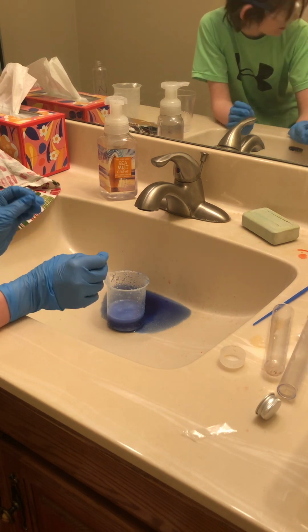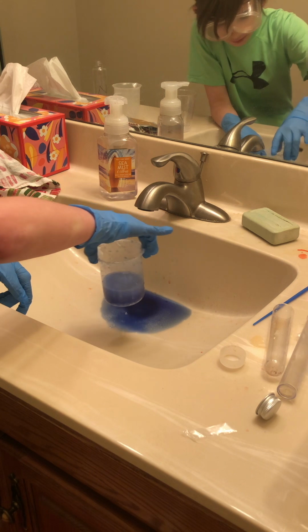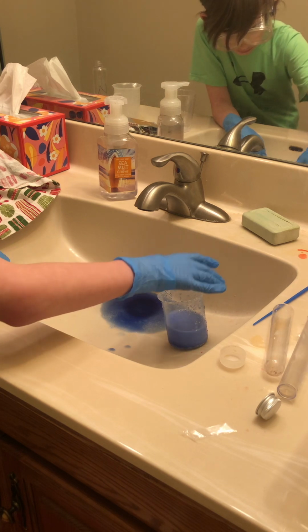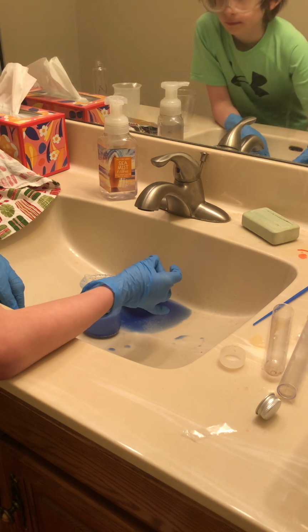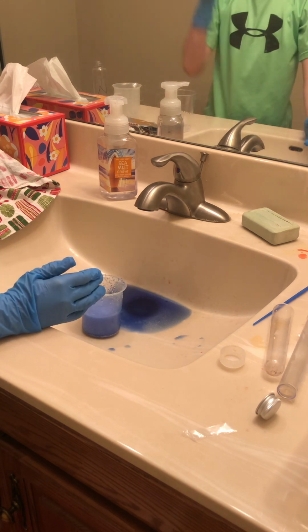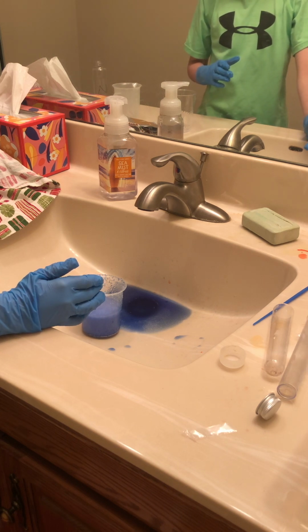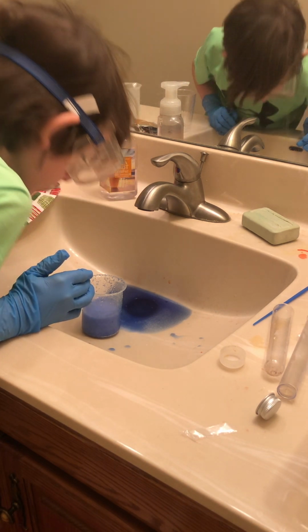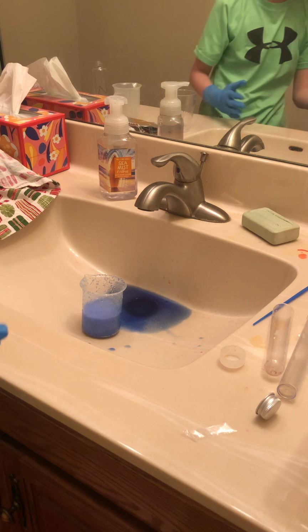Now, if you want to do exactly what I do, then you can do this. You're gonna take the beaker and you are gonna set it. Well, actually, no, you're gonna put it, that's still reacting. Man, is that releasing a gas? Definitely an oxygen one. Okay. I don't know what's really going on, but whatever.